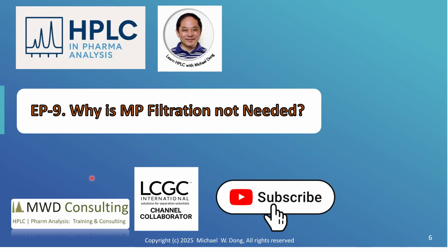The end of episode number 9. Why is mobile phase filtration not truly needed? And how do you get away from it without problems?